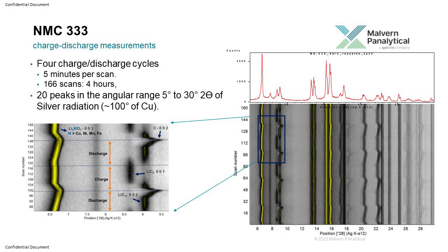Now you can see that with discharge, this is the 2 theta, so this peak is moving to the left. This is the isoline plot. Color represents the intensity, and the position represents the 2 theta angle or the lattice parameter. If it is moving to the right, that means lattice contraction. So lattice is contracting, and if the lattice is contracting, your particle will also contract.